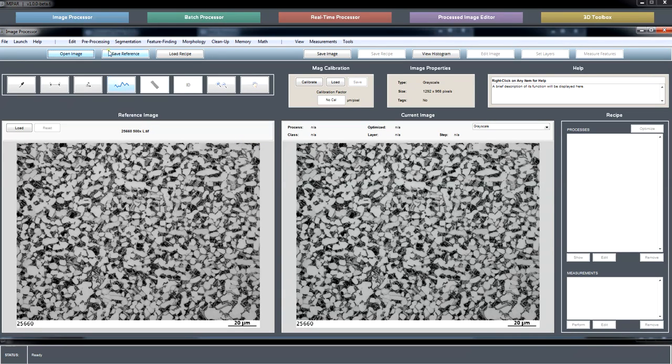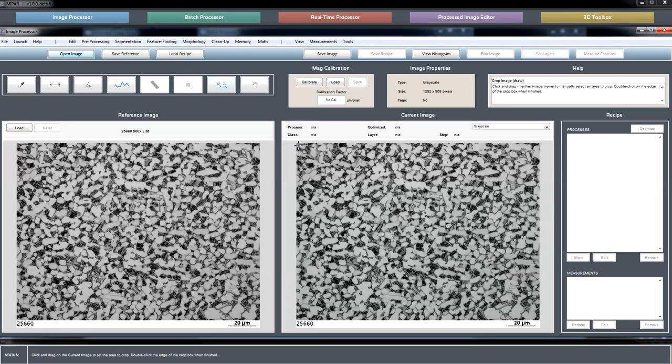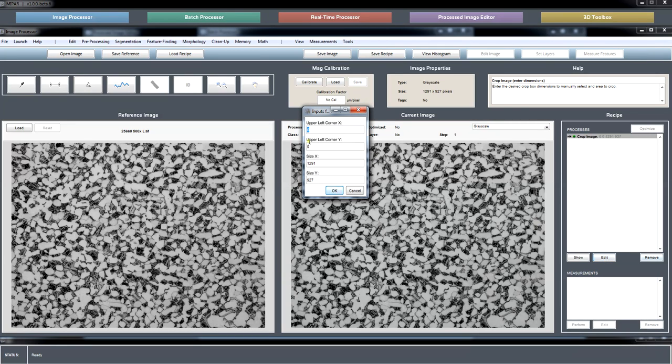So when you go to crop an image, usually it's hard to know what the dimensions should be before you see them shown to you after a draw. So you can first choose to draw. And now the parameters for the crop are the dimensions of the crop box. So if you clicked on edit now you're editing the position of the crop box.